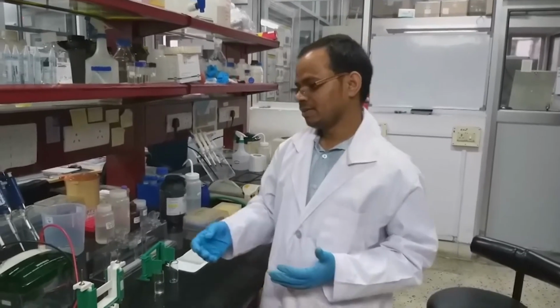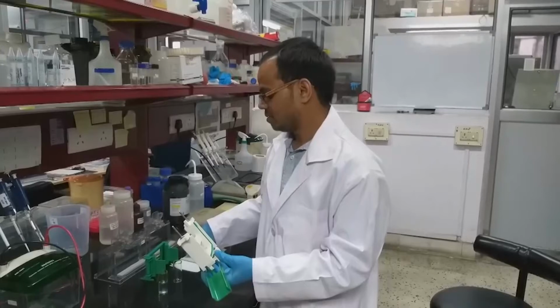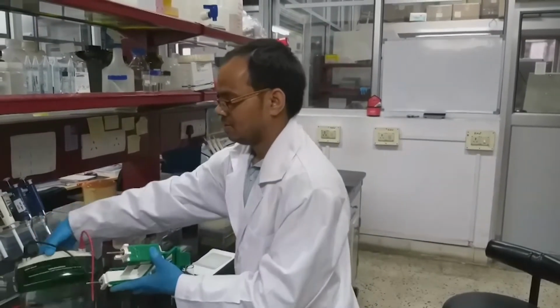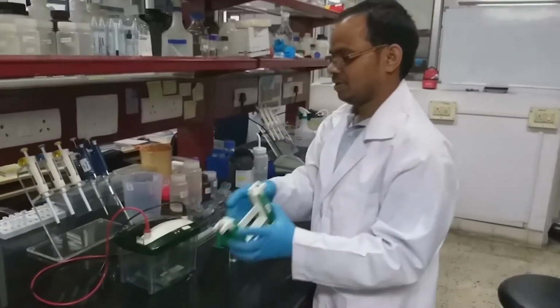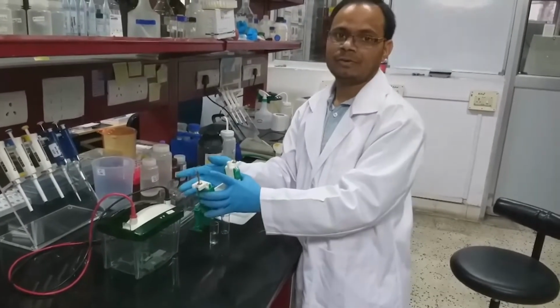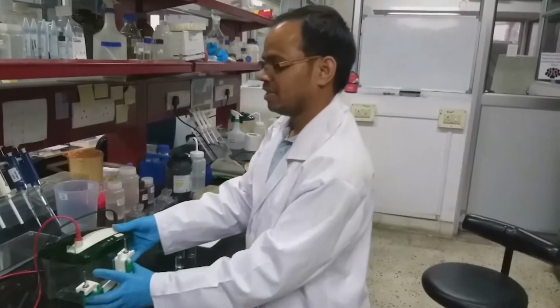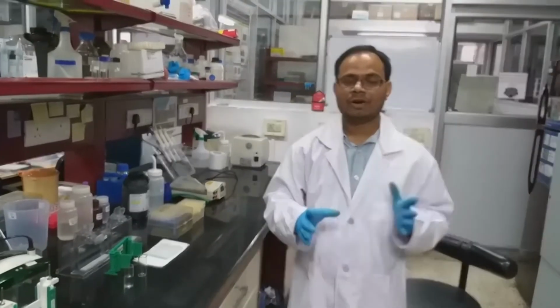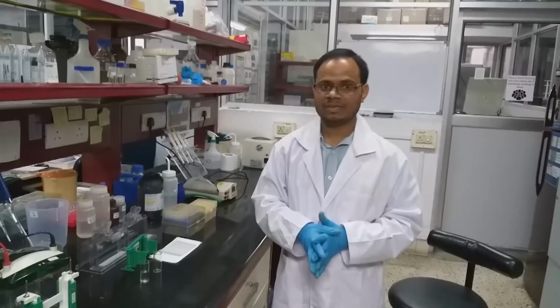After that, we fix this gel into this one, keep it in this reservoir, connect it to the power pack, and run the gel. So this is the overall introduction of how to prepare an SDS based gel.